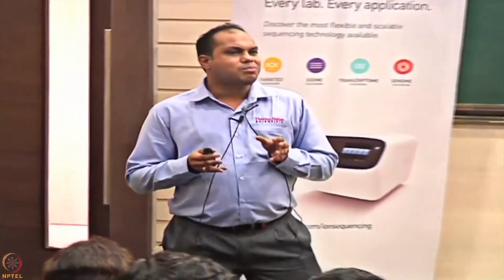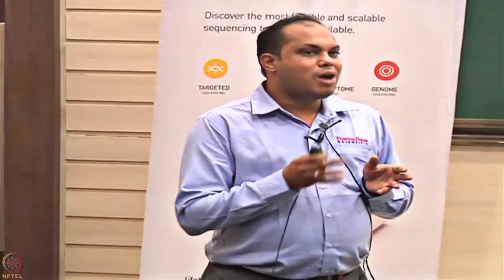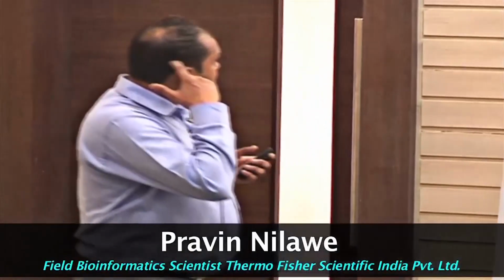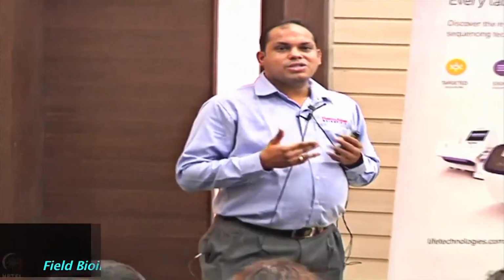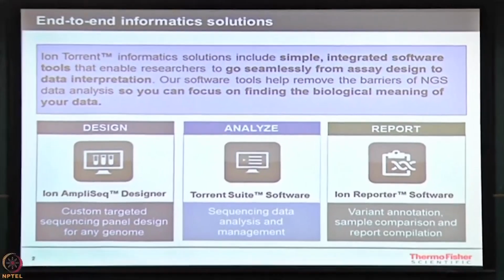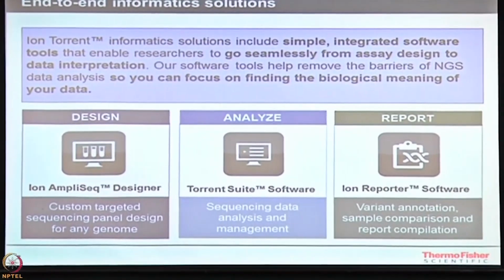Today we will take it somehow to the steps of understanding those sequencing and how it is interpreted into results, okay. So, I will take it point by point, what it is actually. So, we can move forward. So, what we are looking at into NGS technology or NGS sequencing, we are looking into something like where we will have end-to-end workflows or end-to-end analysis to be completed, right.